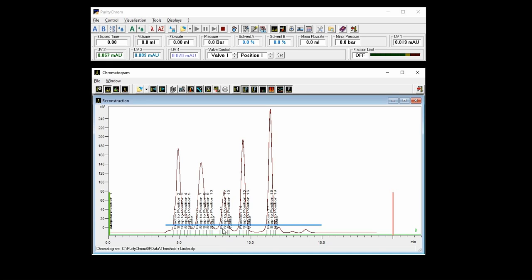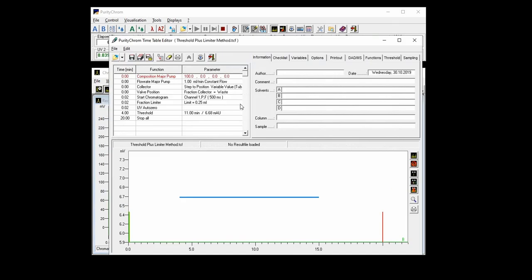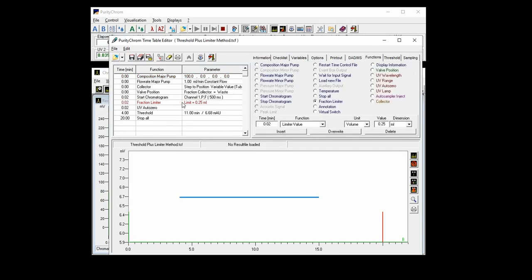I will now show you how you can create a method using this threshold. And again, you start by simply putting the composition of the pumps, the valves and so on. You start your chromatogram and here you can already see that I set the limiter at 0.25 milliliters so that it is really narrowly fractionated. For sure, you always have to think about your flow rate when setting a limiter. When you go with one milliliter per minute, this volume is perfect. But when you go to higher volumes, also your fraction limiter volume will increase.